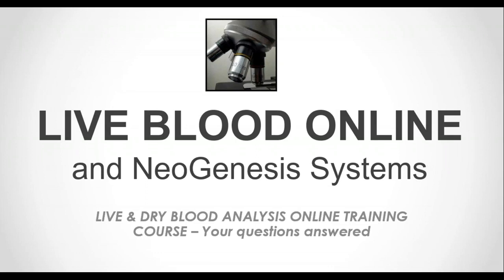And do you provide training in the use of microscopes? Well, yes, absolutely. That's part of the course. We do have some standard videos and training available on the use of microscopes. A large part of that is included in the actual training on looking at blood samples after you've taken the blood samples, and we do offer additional support to our attendees as well with regards to any technical questions they might have with their microscopes.